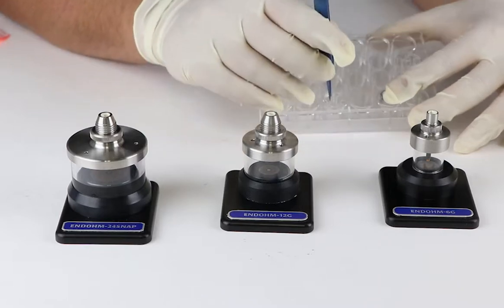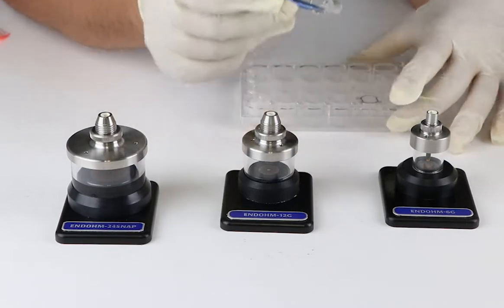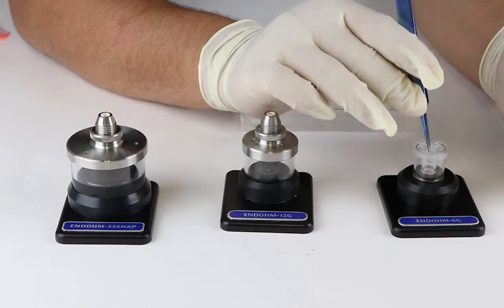Similarly, a 24-well hanging insert can hang inside an endohm 6G.